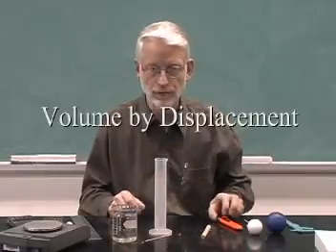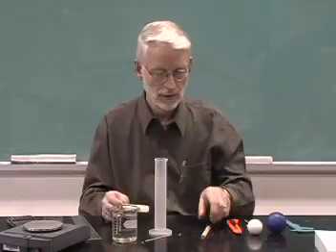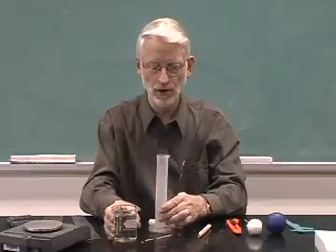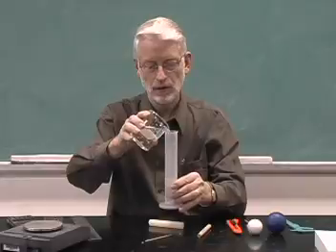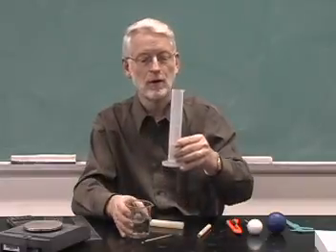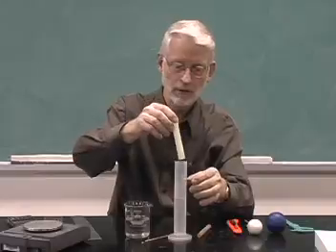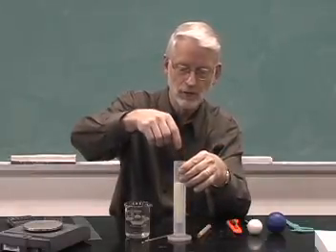To have students confirm the calculated volume of their cylindrical object, they can actually measure the volume by the displacement of water. We'll take some water in a graduated cylinder, and I have here 67 milliliters. Now I can lower my candle into the water.